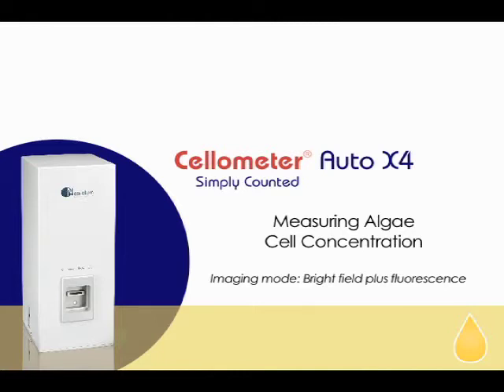For most fluorescent assays, cells are stained at this stage. In this case, the cell sample is not stained. Autofluorescence from chlorophyll is used as an indicator separating cells from debris.